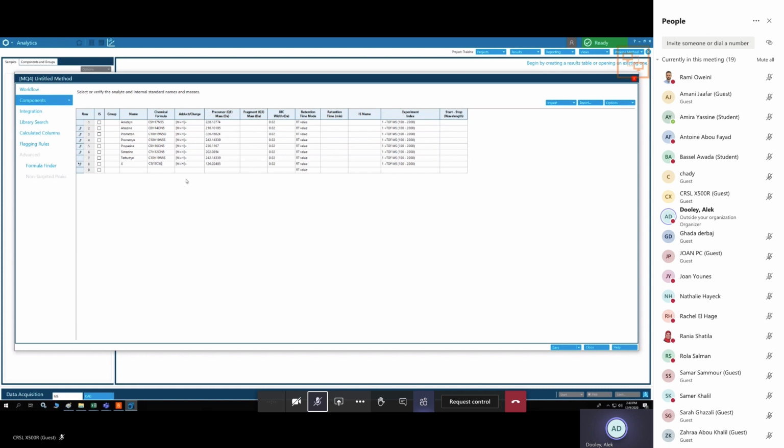All right, so if you are using deuterium, you put 2H3, which means 3 deuteriums. If you remember, the superscript number in front of the elemental symbol means the change in the neutrons, right? So that's how you put isotopes, if you want to force it to use the isotope.